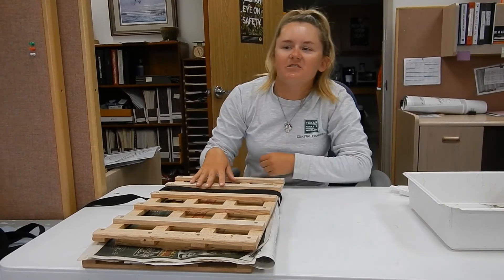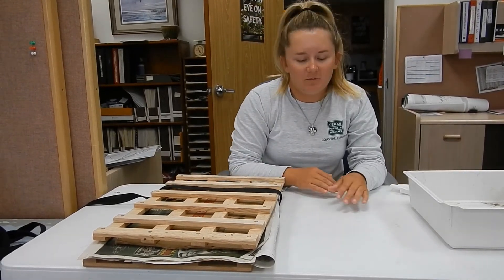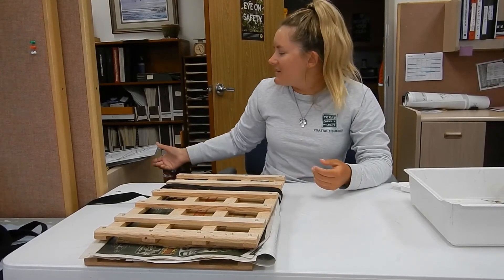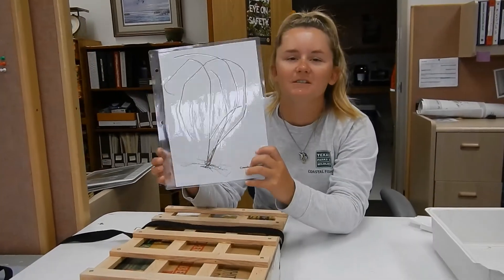After two to three weeks, you're going to take it out and we usually put it on a cleaner piece of cardstock and laminate it. And then it'll look like this.